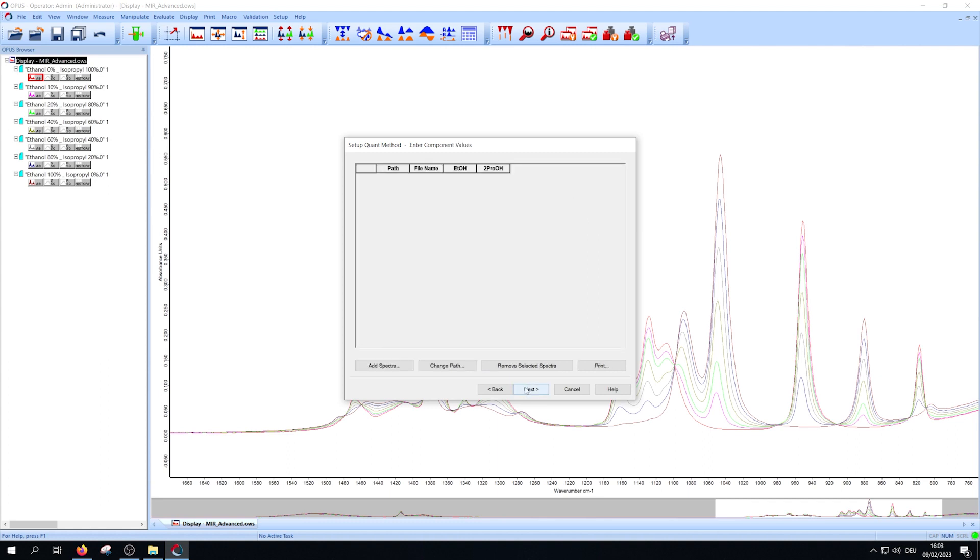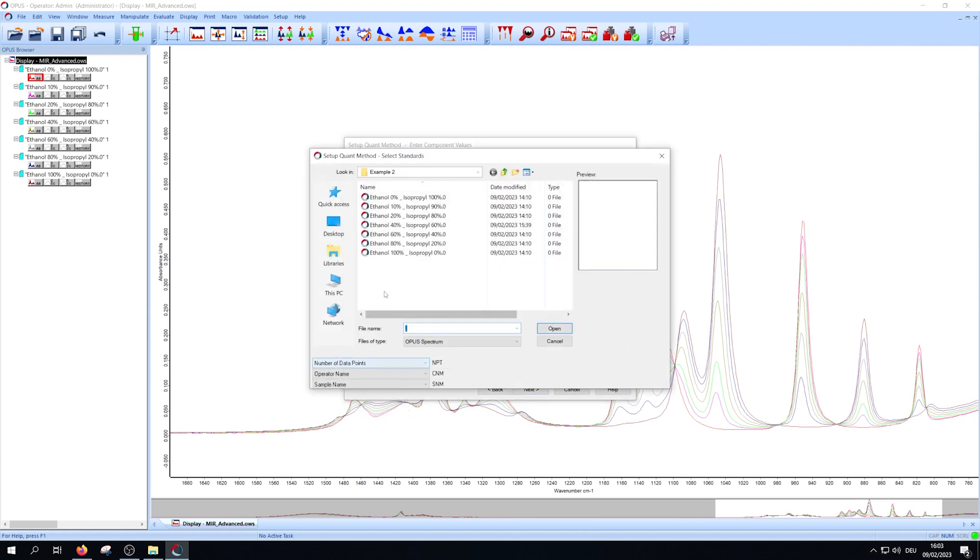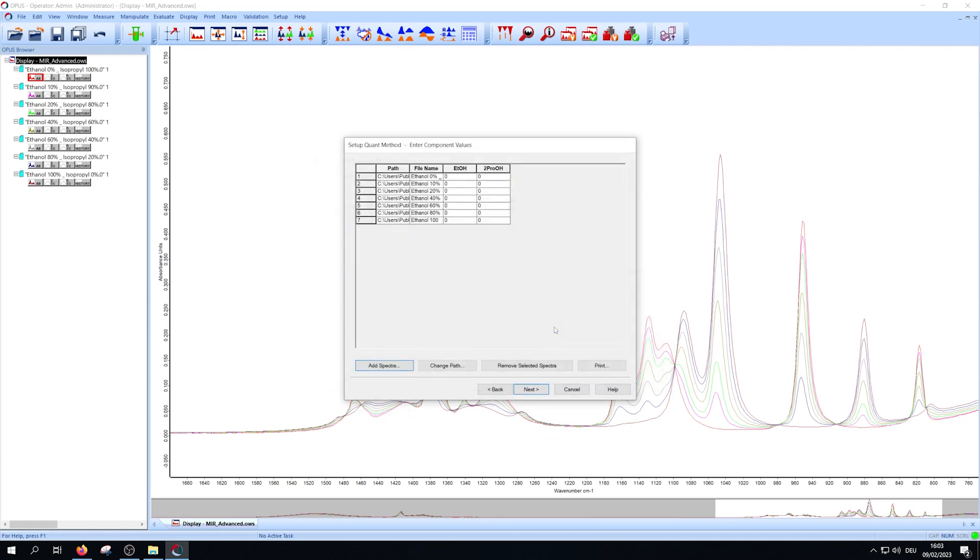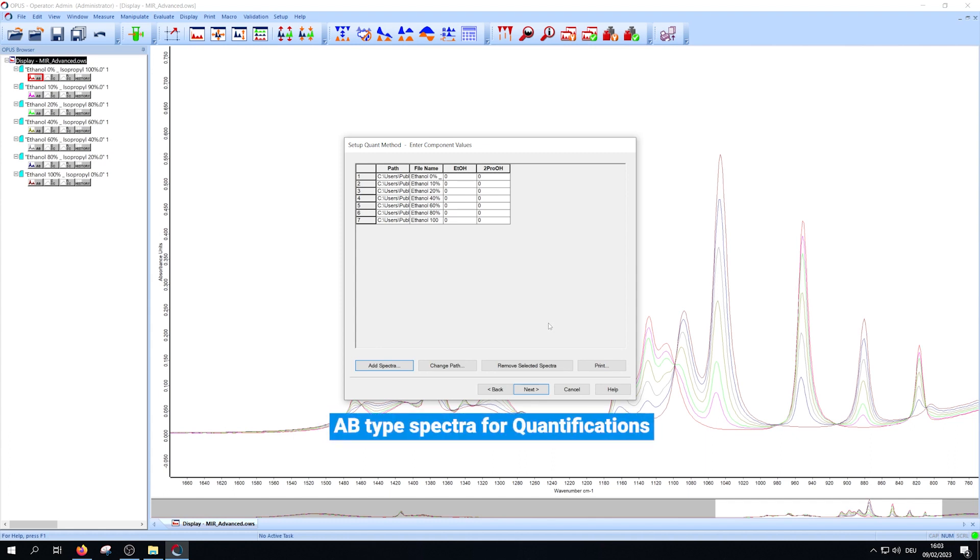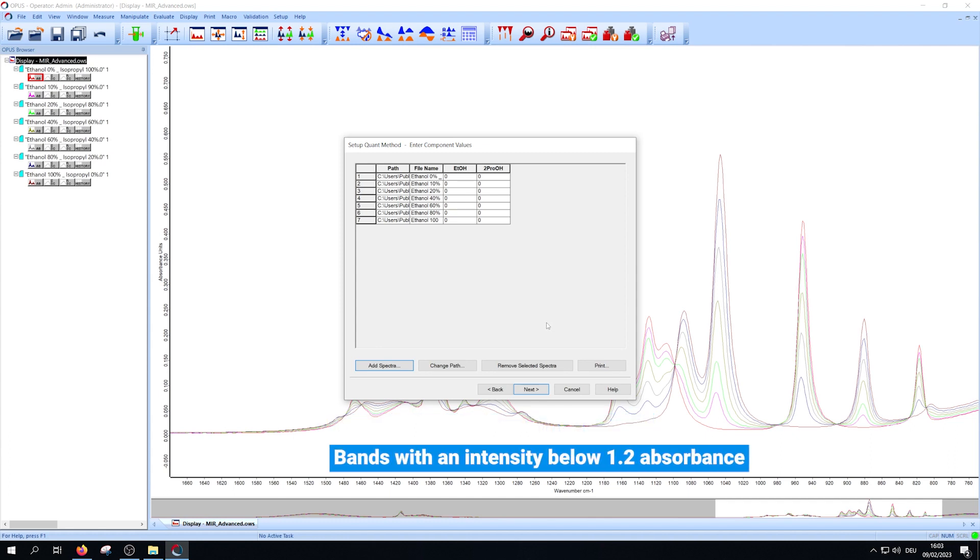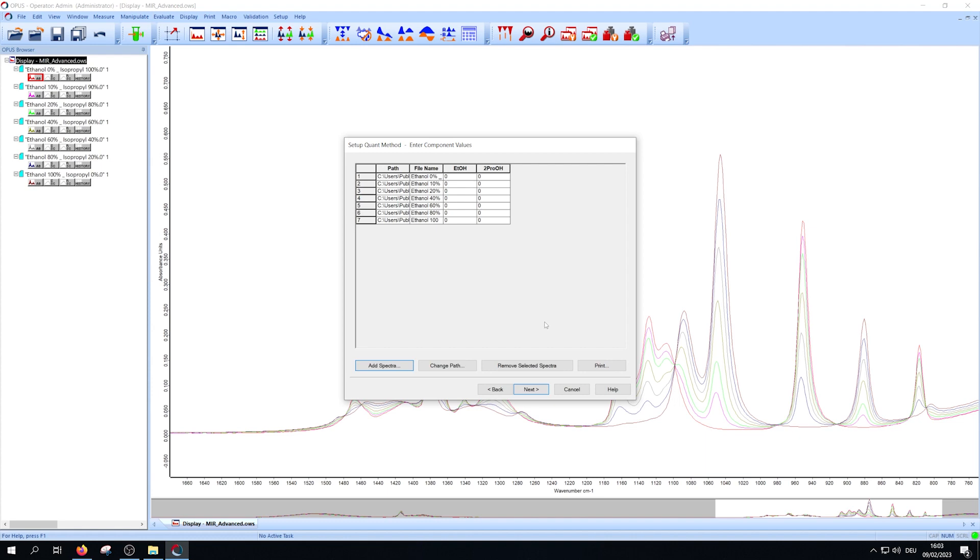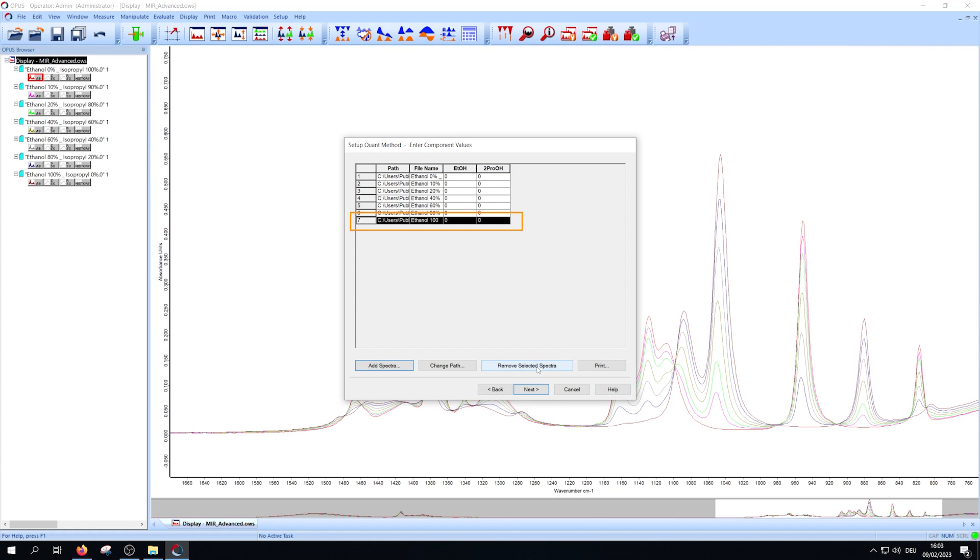In the next window you have to add the reference spectra. Press add spectra, select your files and press open. Typically you want to use AB-type spectra for quantifications and bands with an intensity below an absorbance of 1.2. If you opened a wrong one you can select it and press remove selected spectra to delete it.